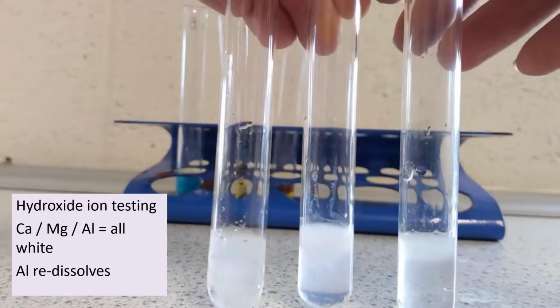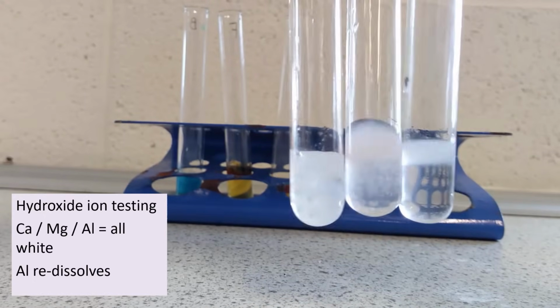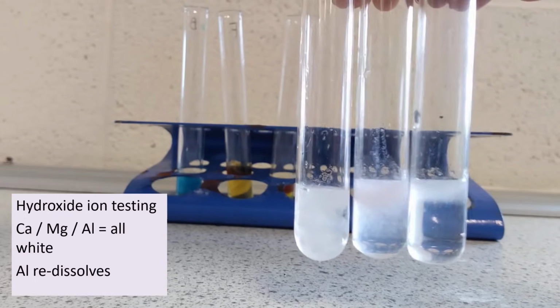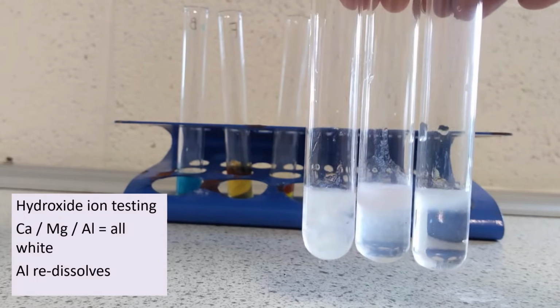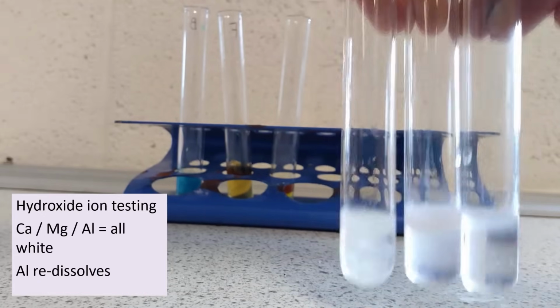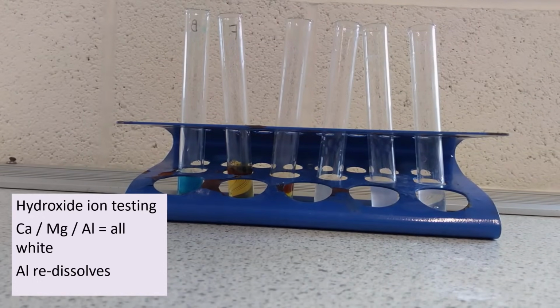So these are calcium and magnesium and aluminium salts, and you can see they don't look identical to each other, but they are all forming a white precipitate. So that's not hugely useful. It means I can tell that it's one of the 3, but I can't tell which one it is. However, if I add an excess of sodium hydroxide, then aluminium ions will redissolve.